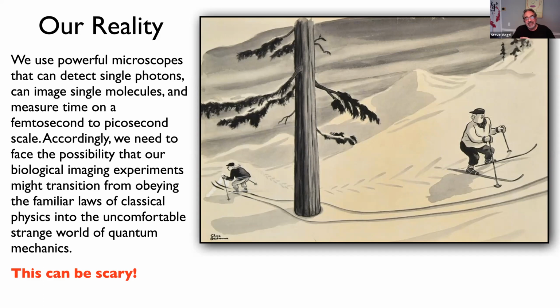This is the realm of quantum mechanics, and we slowly slid into it. Most of us, particularly from a biology background, are just doing microscopy, imaging cells, nothing special. And as our capabilities got better and better, we slowly and silently slid into a new regime where the normal rules of physics may not necessarily be applying. And that's the point of this cartoon here, is that sometimes in the course of doing our experiments, we see some really strange things, and we don't understand them.